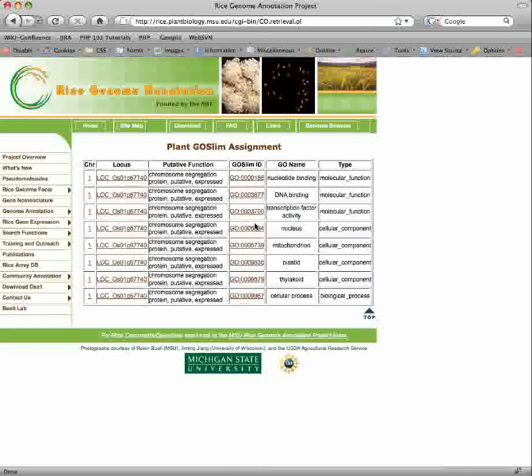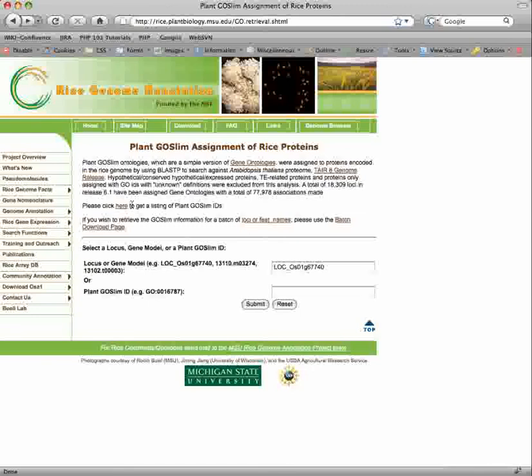The output also includes the GO name and type of GO term. The locus ID is linked to the gene report page, and the GO slim identifier is linked to the gene ontology report for the GO term. Or, you can find all of the loci associated with the plant GO slim by inserting a GO identifier.